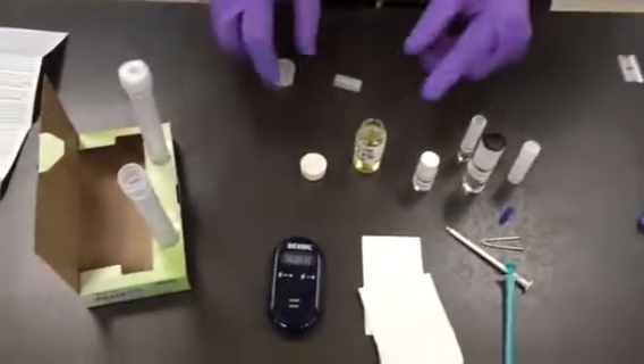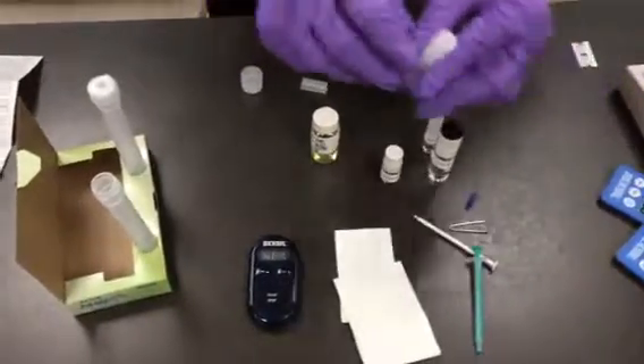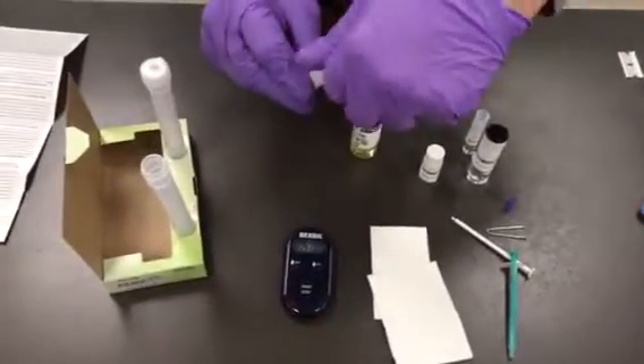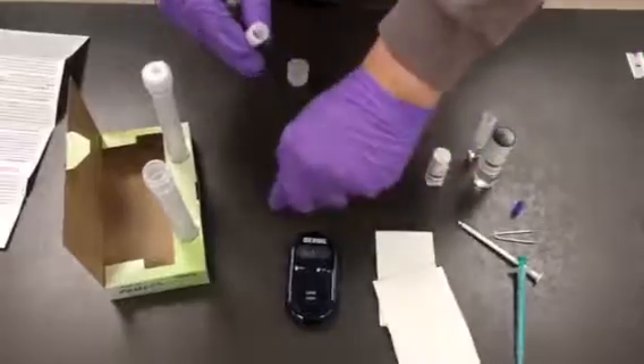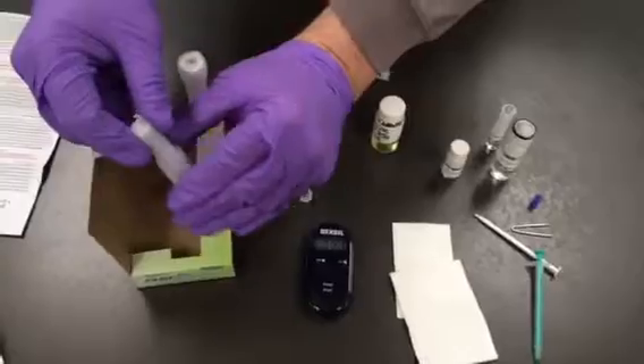Next, we're going to put the contents of our four milliliter plastic vial into the reaction tube. Just make sure they all make their way in by tapping the back.